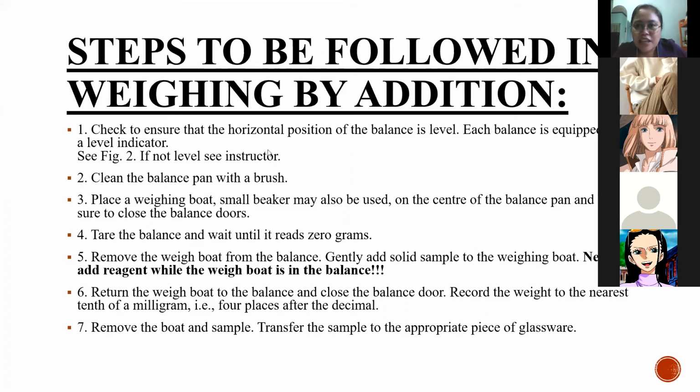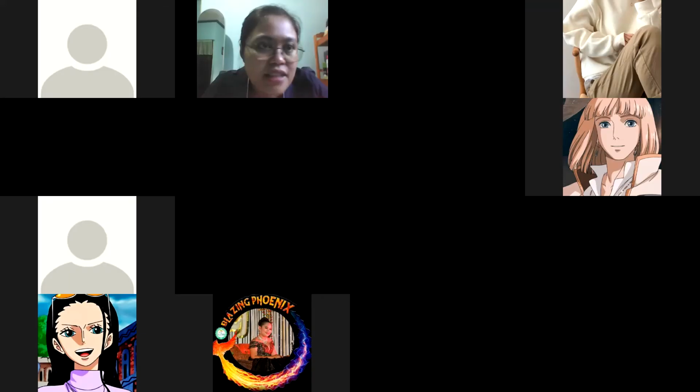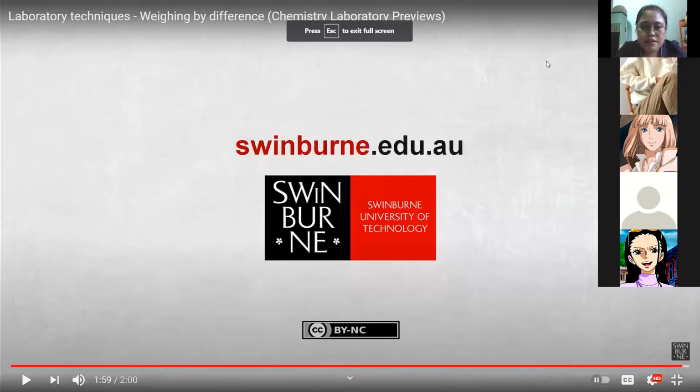Okay, so that was weighing by addition. And the next technique in weighing, which is the most accurate one, is weighing by difference. So let's see how we are going to do the weighing by difference, and let's see why it is the most accurate.